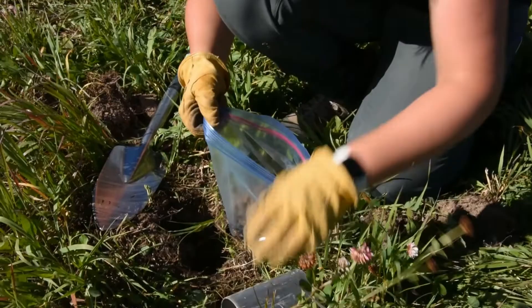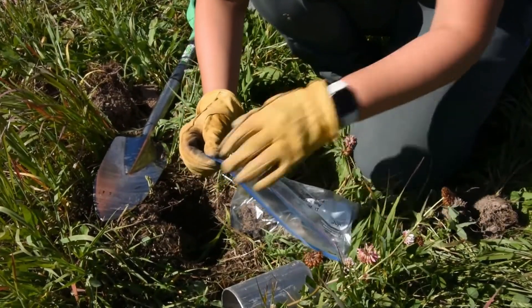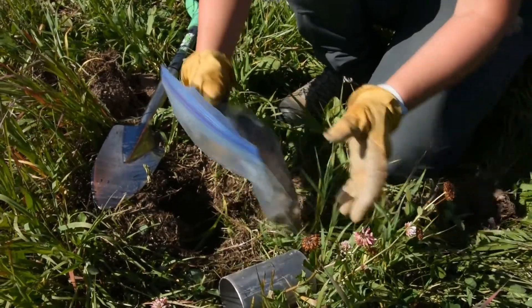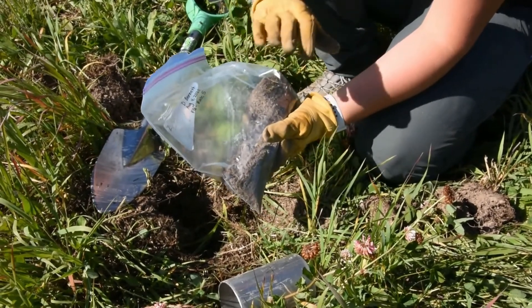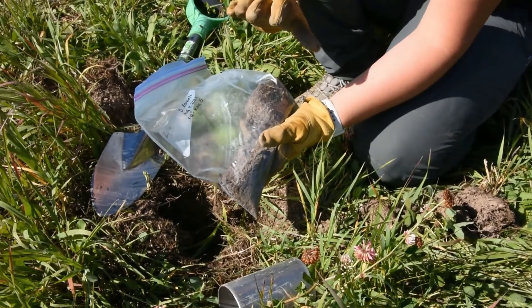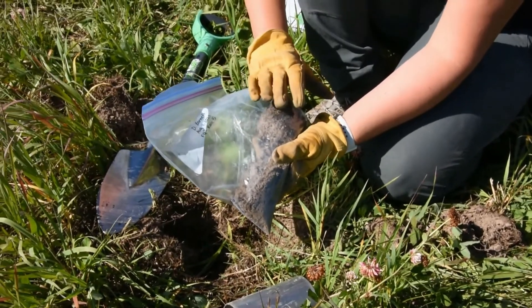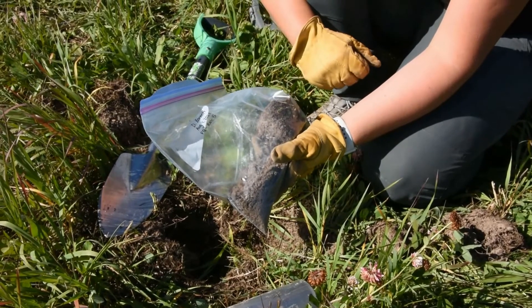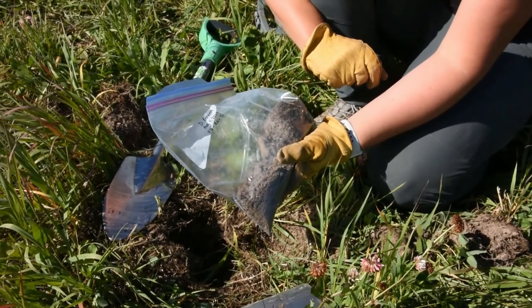Then place it in your Ziploc bag. Once your sample is in the bag, you can take it back to the lab. You'll want to take the weight of it as soon as possible — we want to know what the field wet weight is of your sample, and we'll then walk you through the next steps of calculating your bulk density. You will also use this sample to do your soil aggregate test.